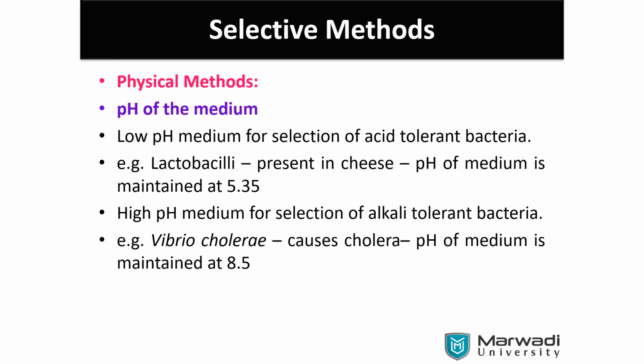Okay, by adding the acid or base. So which acid are you using? HCl. Okay. Any other? NaOH. Okay, HCl, NaOH. For the basic, here it is acidic. Either we go for HCl, sometimes sulfuric acid. In general, there are several others also. I'm just giving a few examples.